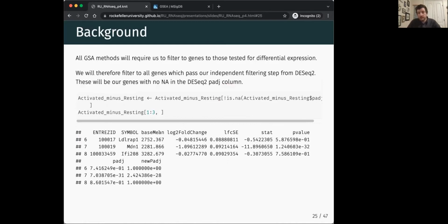So first, before we can do anything, we have to do the NA filtering. This is a repeating step that we're learning about as we get these NAs. Often, if you supply a value with an NA to a tool, a package, it will just break because it's not expecting NAs, it's expecting numbers.